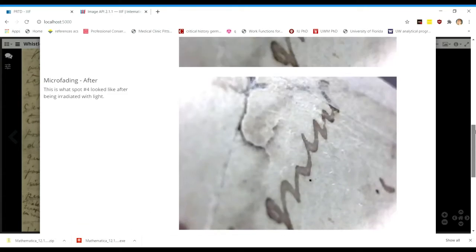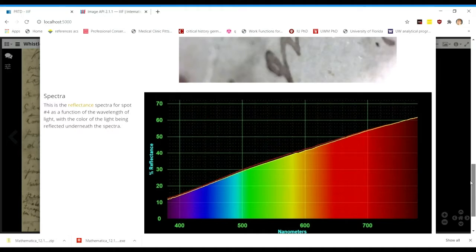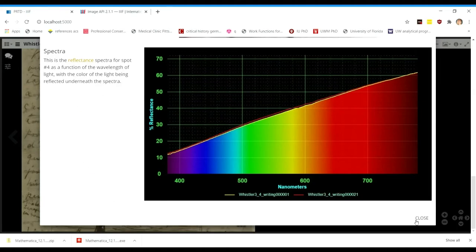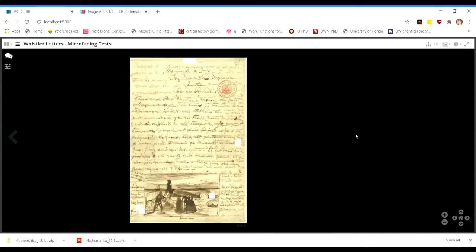This is really cool because you can see all of these different pieces of information layered together with one another, which not only makes this data more accessible to scientists, but also to the everyday public viewer. Connecting these spectra to the physical document, to a physical point, makes it easier to remember why this data is important and will remain with the person viewing the object regardless of their physical location.